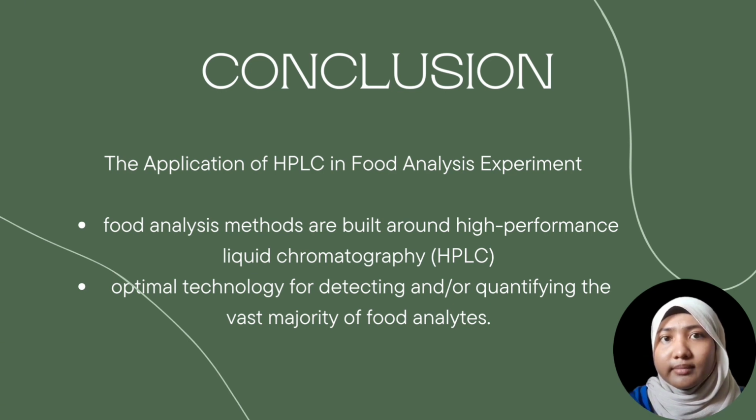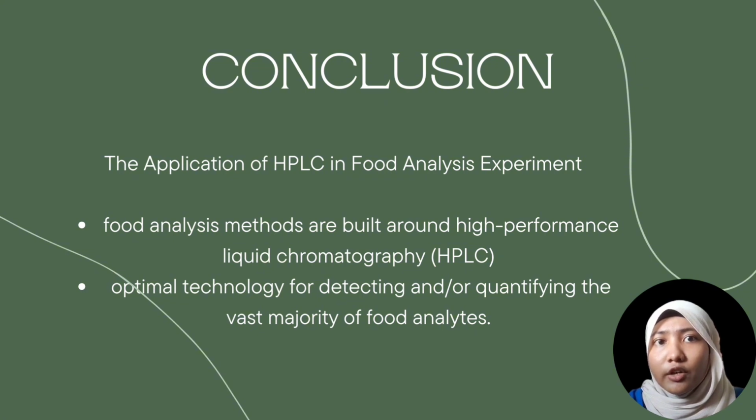HPLC analytes can often be identified on the basis of their retention times and either their UV-visible or mass spectra. Spectral information is especially useful for identifying co-eluting peaks, which turn up fairly frequently in many food matrices. In such cases, diode array detection across multiple wavelengths or scanning across the mass spectrometry range enables the deconvolution of overlapping peaks.